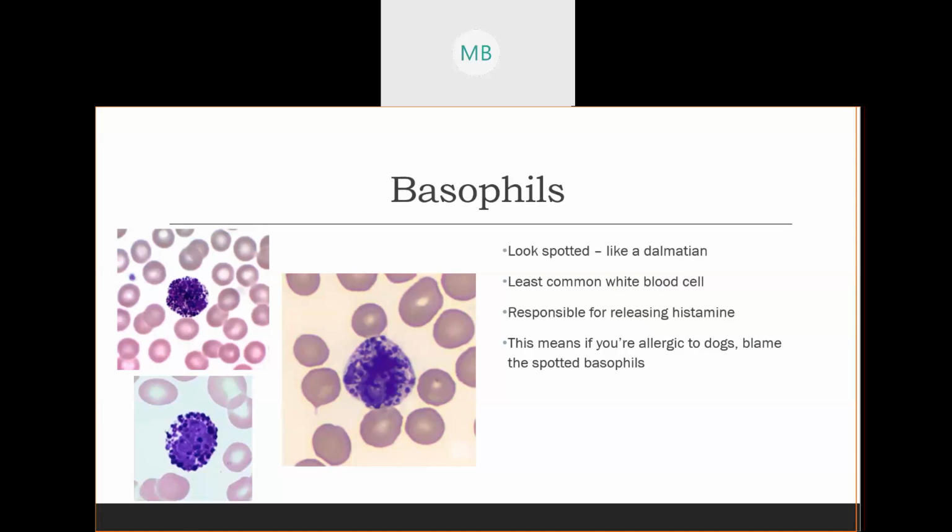If you have allergies, these guys are a little bit too active and you curse them every single spring, whether you know you're cursing them or not. Because histamine will also make you have the runny nose, the swollen, itchy eyes, all those allergy responses that we know. So basophils look like they are spotted. See how it looks like it has polka dots on them? And this one is very polka dotty. This one is very spotted. So your basophils are spotted like a Dalmatian.